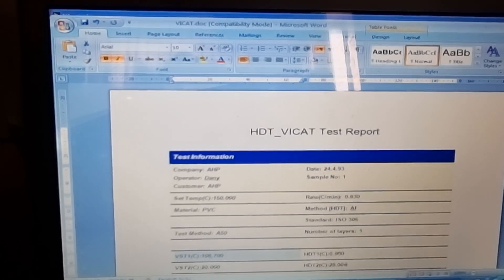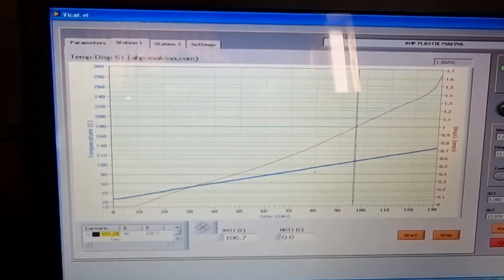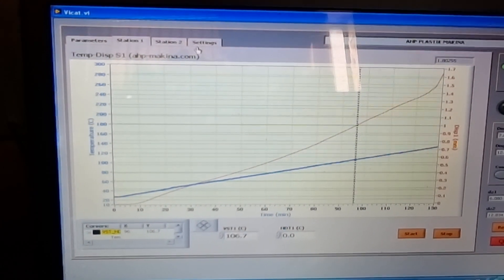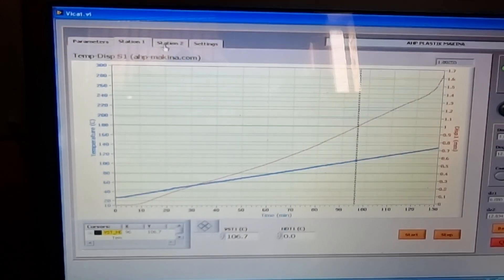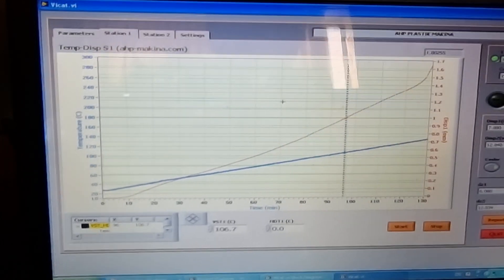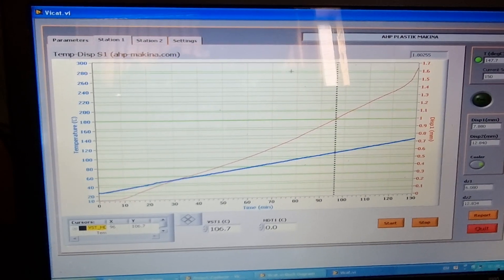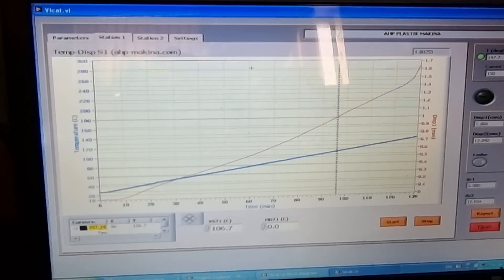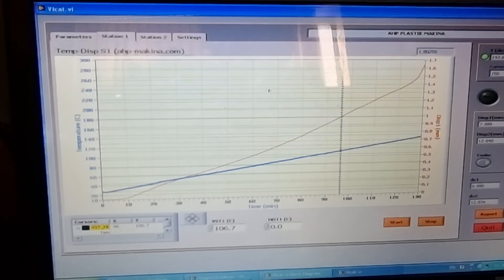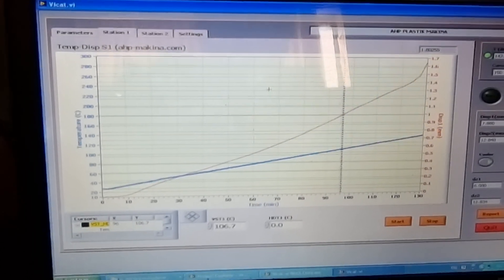As you see, you can save it as PDF or print it out, or whatever you want you can do with the Microsoft Word files. It's easy to use HDT Vicat tester from AHP Plastik Makina.